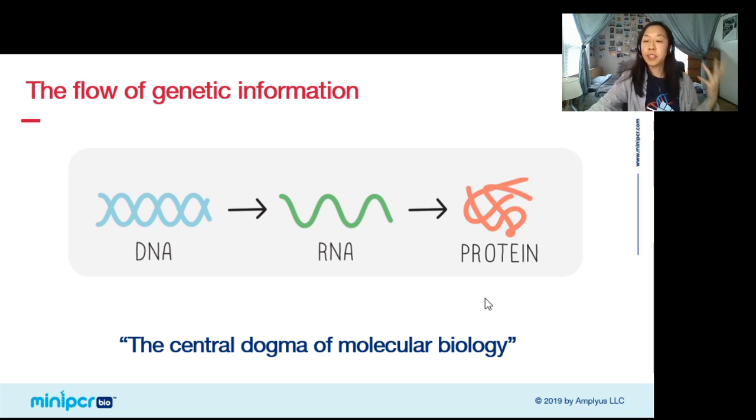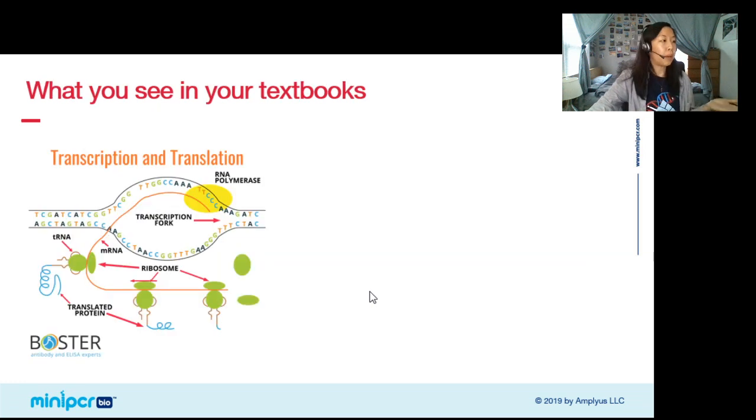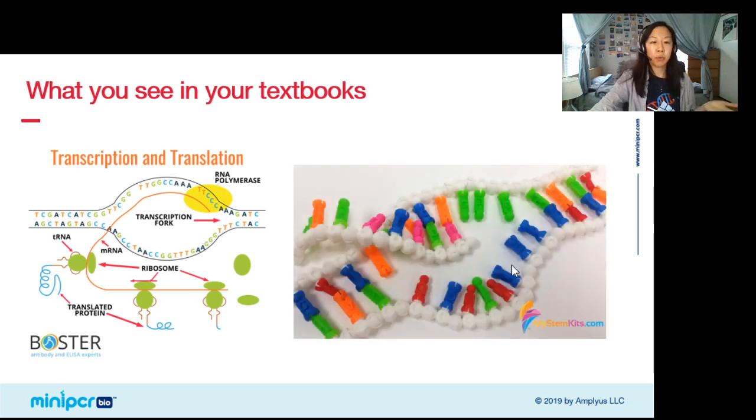When you're first teaching or learning about DNA, this abstract diagram that I'm showing here is probably a little too simple. But when you open up your textbooks, you probably see something like this, which can be pretty confusing and overwhelming for someone learning about it for the first time. Manipulatives and 3D models can be really helpful to students to visualize these molecular concepts and make them a little less abstract. Today, I'm going to show you another way that we can visualize these molecular concepts using a hands-on lab activity that lets students actually see real DNA and real proteins in action.